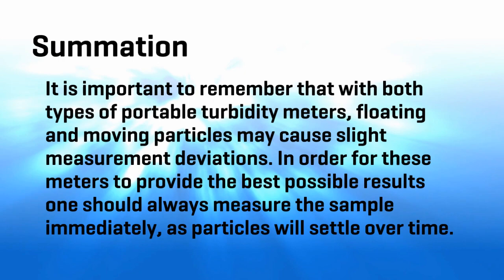And to that end, meters will use averaging. They'll take three quick tests in a row and then average it out to try to balance that out. Or the ratio method, which I don't know how much you know about ratios, but like a 3-to-1 ratio or 5-to-1 ratio. Basically, it's taking multiple readings and equating them to what are the most common denominators and providing you with a number based on that. So it basically is more accurate than simply taking one quick reading and going with that. It helps with the fact that this is dynamic. None of them are perfect, but what we're trying to do here is just get something that's going to give us the most accurate reading as possible.